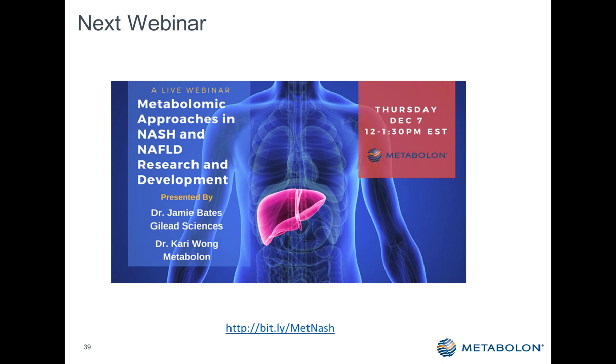One of the things I have been very keen to do within Metabolon in the future is use a targeted approach. Obviously, we measure a lot of the bile acids, and we have a bile acid functional panel, which is a fully quantified targeted panel for analysis of bile acids. So one of the things I'm keen to do is set up a set of toxicology type functional panels, so fully quantitative targeted assays for analysis of markers that we know to be important in both kidney tox and liver tox.